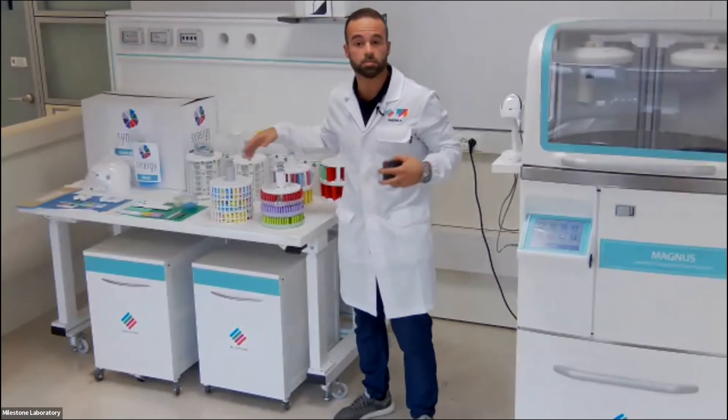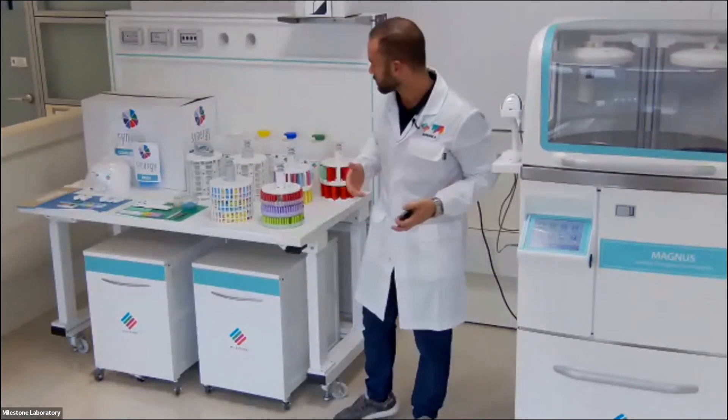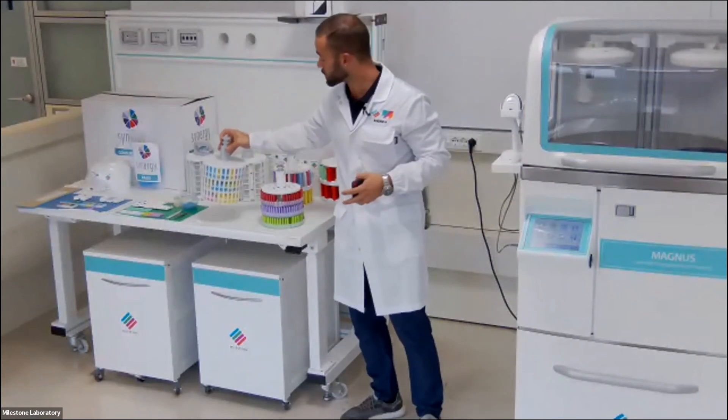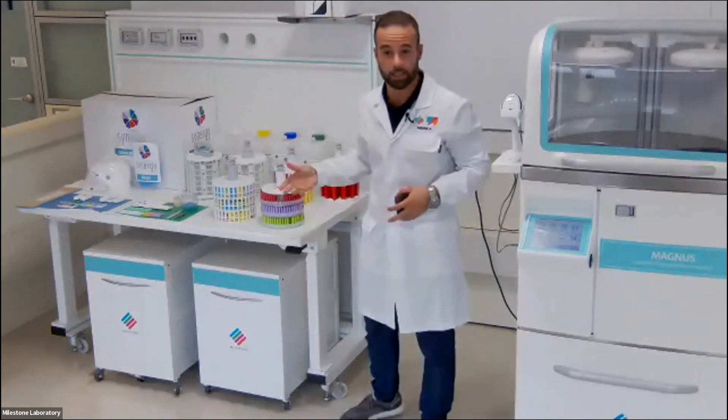Many cassettes, it depends on the needs. We have the random basket rack that holds 300 cassettes.